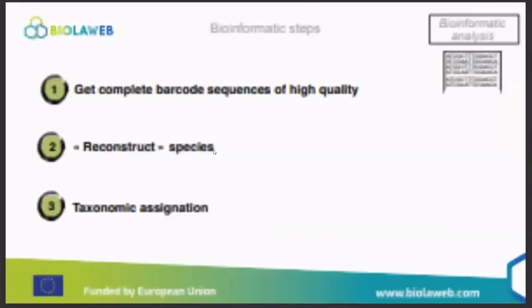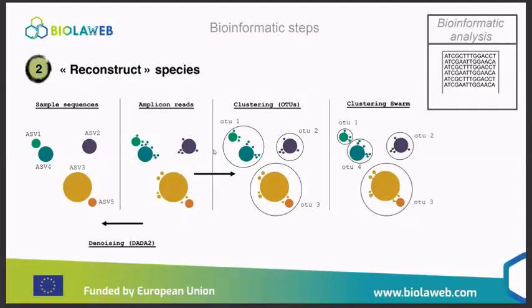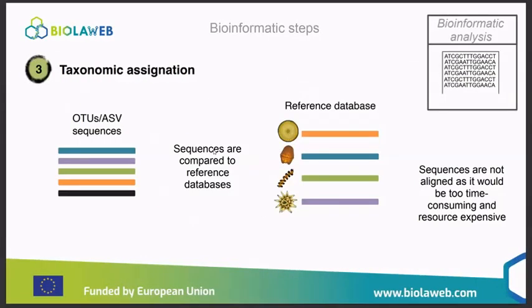Maybe we can move toward the end. And then you assign taxonomically. The principle is to compare your sequence to reference databases. I won't go into details of the algorithms under this, but you have to know that you don't fully align your sequence, because you have to manage millions of reads, and it would take too much memory and time. It's very long.